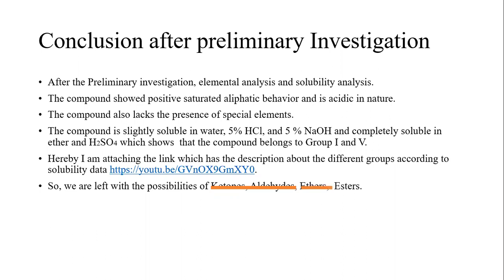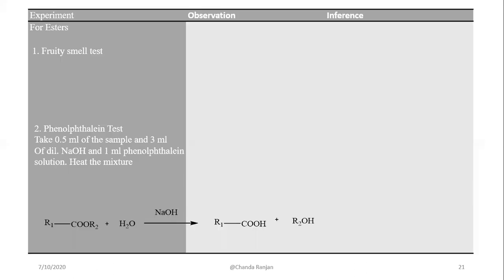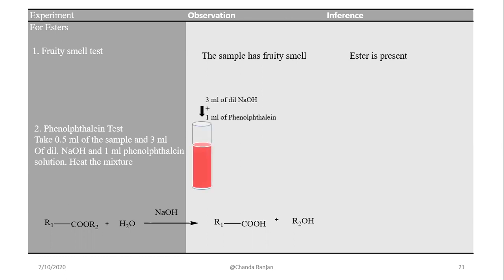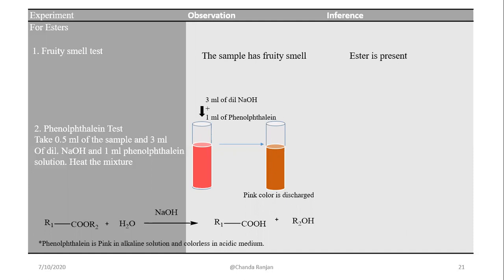So what we are left with is the possibility that the compound is an ester. We will now check the ester functional group. For esters, we have the fruity smell test — already in the preliminary investigation the compound had a fruity smell, so it can be an ester. We have another test for esters: the phenolphthalein test. We take the sample, dissolve it in NaOH, and add 1 mL of phenolphthalein. If the pink color is discharged, it shows the presence of ester. Here the pink color has been discharged, so ester is present.